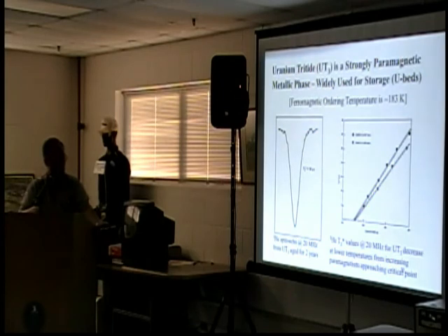500 microseconds. So the magnetic properties of the uranium hydride itself give an inhomogeneous magnetic field that makes this time constant short. We plotted that as a function of temperature, and we find that the T2 gets shorter as the temperature gets lower, and that it crosses just about where the ferromagnetic ordering temperature is. So it's a confirmation that it's the magnetic properties of the material that determine this T2, the line spectra.